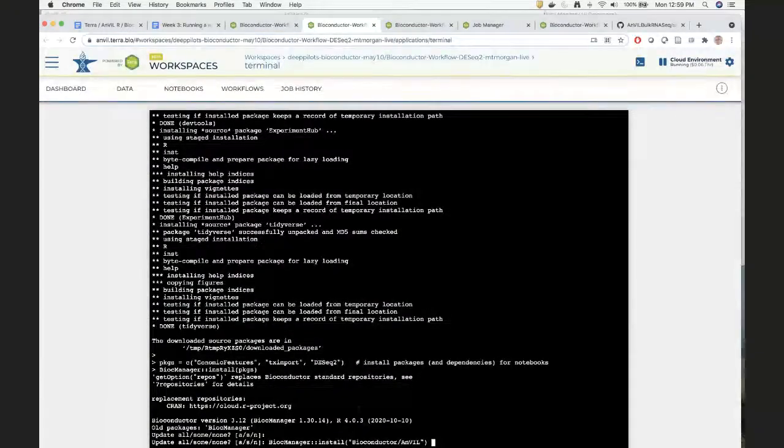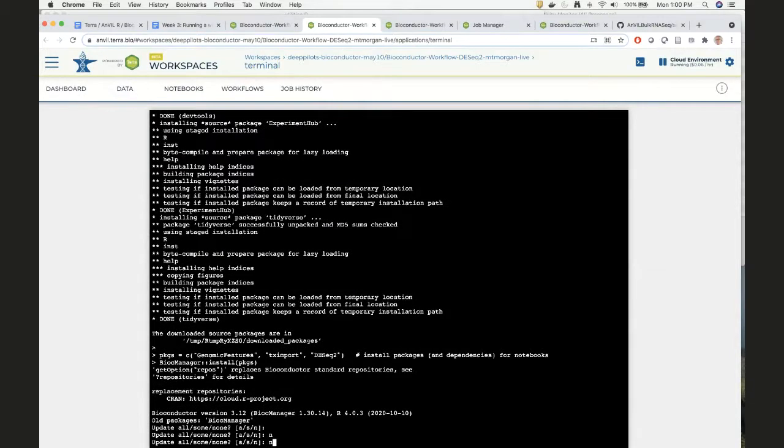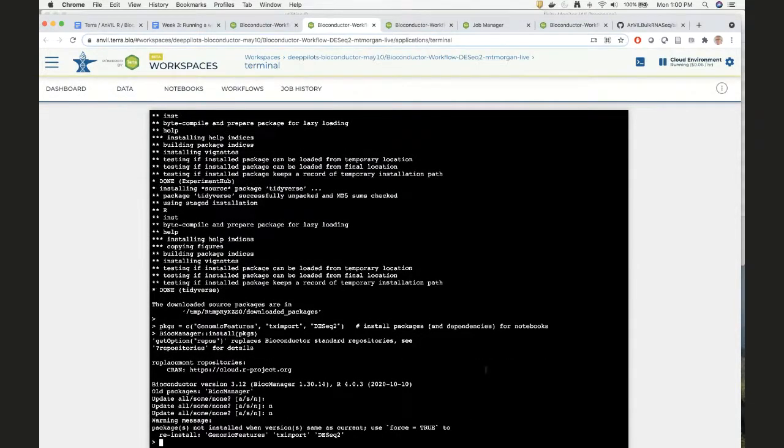It looks like, oh, darn, it asked for something, and that means it didn't install. It got only partway through the installation. Okay, maybe that's fine. Maybe that's good enough. Anyway, we might have to come back to that a little bit.